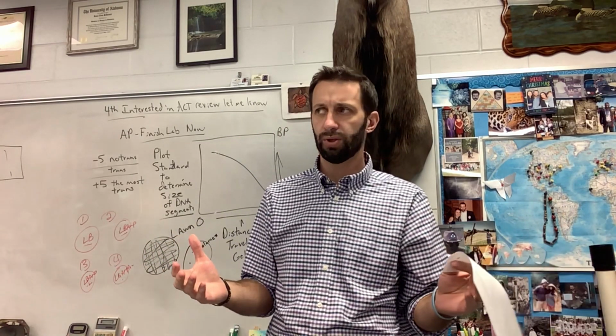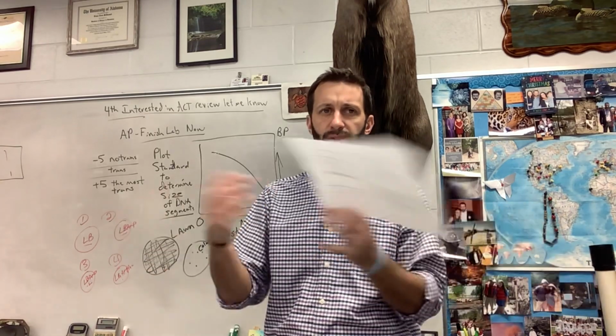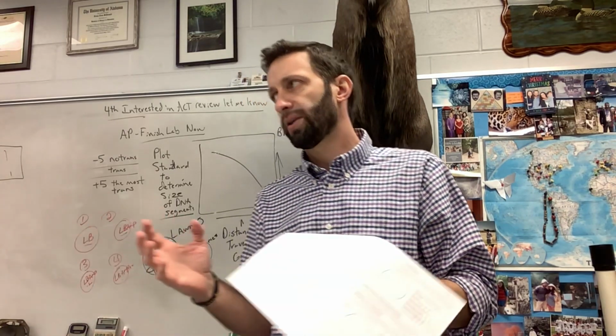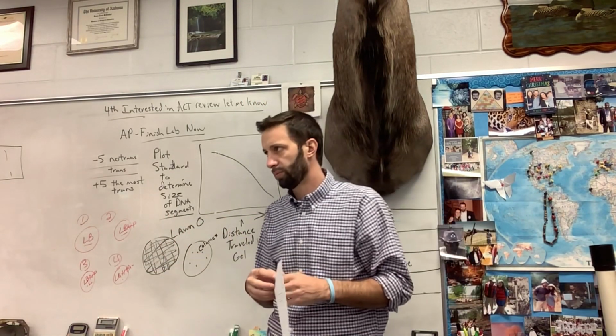All right, the big moment. Yesterday, the transformation lab, you did all that work. You took your bacteria, you took your plasmid with the Pglo gene for fluorescence. You mixed them together, you heated them up, you cooled them down, all that jazz. And in an effort to get those bacteria to take up that DNA and transform, right?